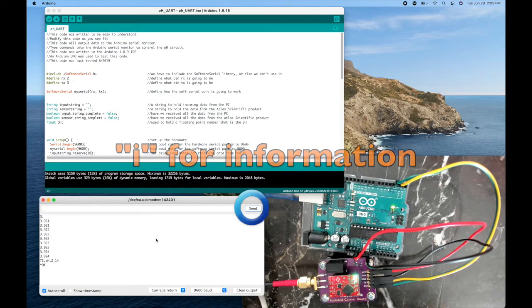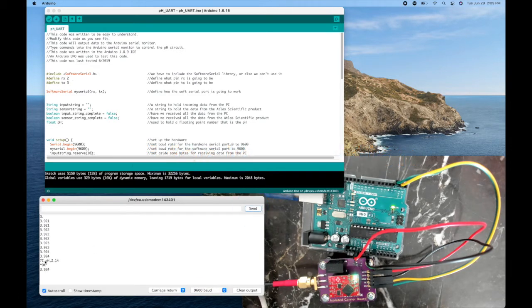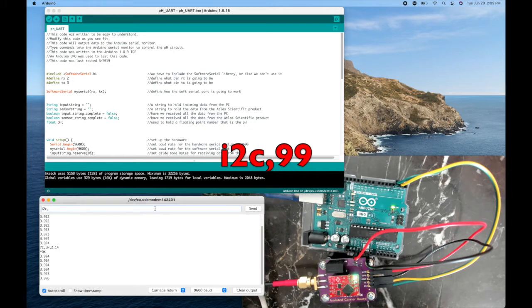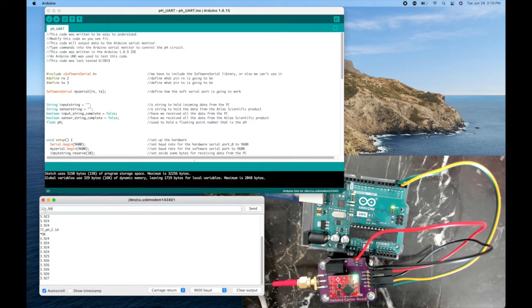You can type I for information, it's the pH sensor. Then you can type I2C comma 99, and this is going to set it into I2C mode with an address of 99.